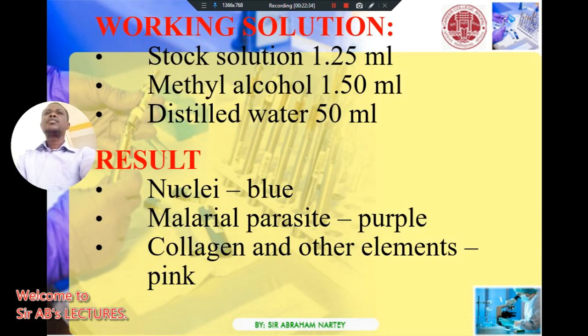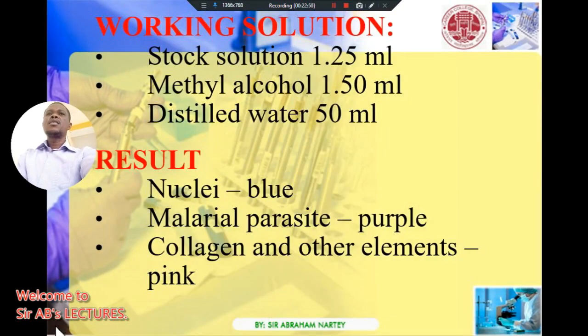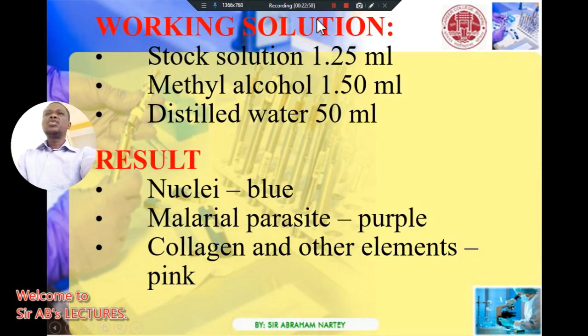Next one, you see the working solution that I'm talking about. So from the stock solution that we prepared earlier on, this is the stock solution. This stock solution that we prepare, you do what? You prepare a working solution out of it.